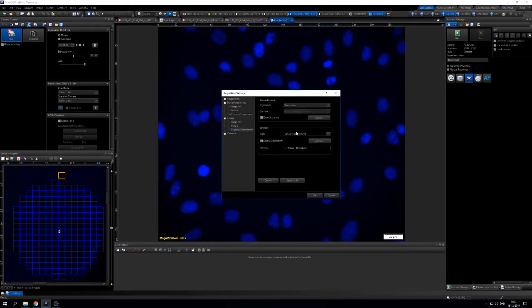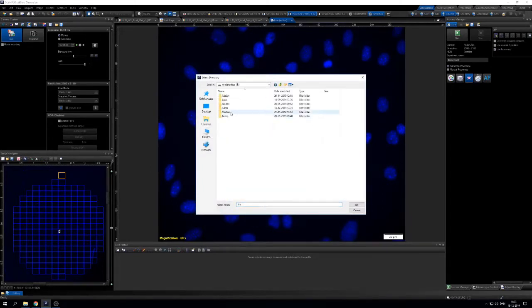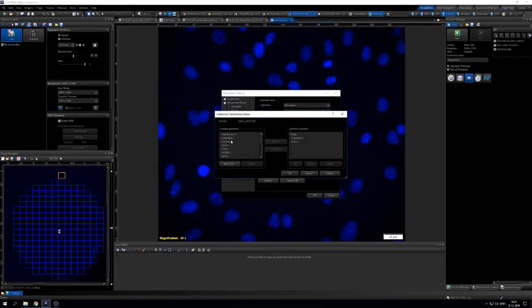So that's meaning multicolor, Z-stacks, whatever you do that is more advanced than just simple images. And you can give it names, like you have probably used to from other software, add it or remove it. And you can make your own, modify it, and give it some special name if it's not in the list to the left.